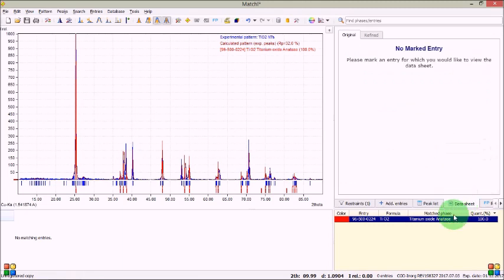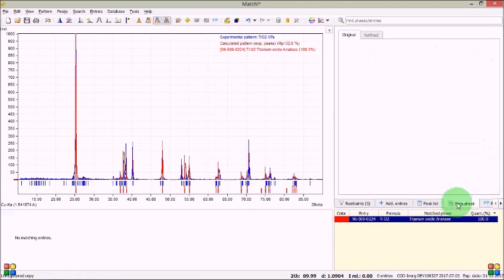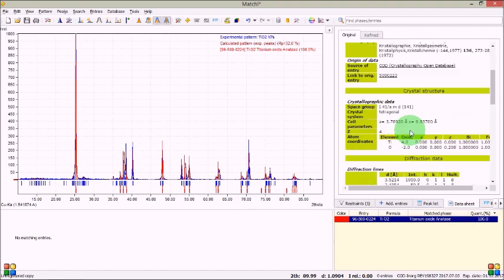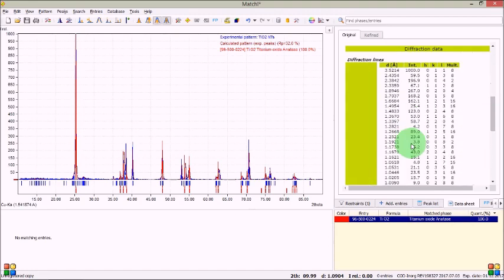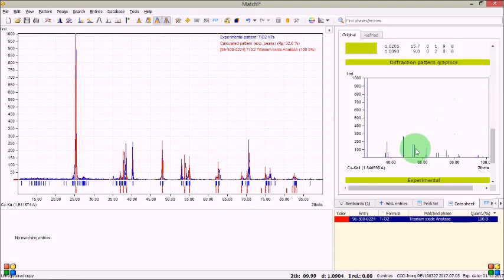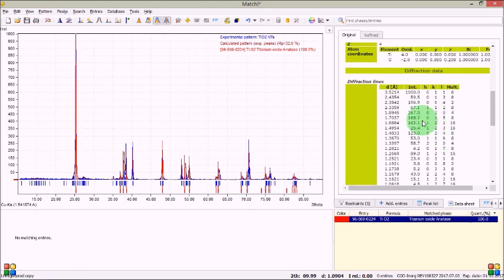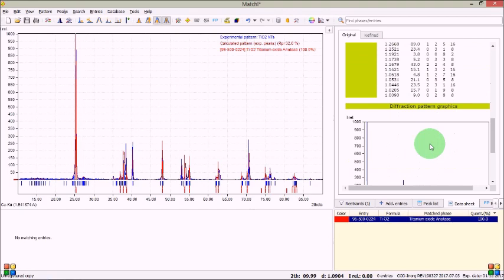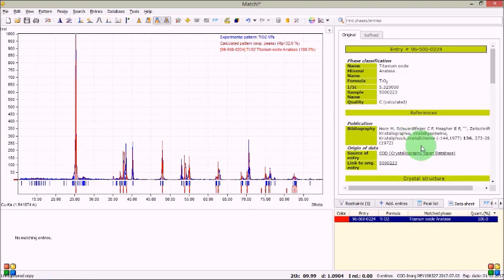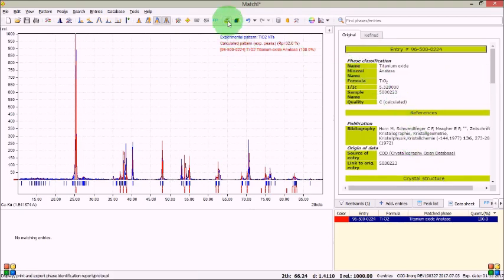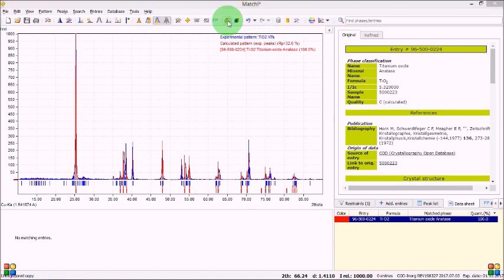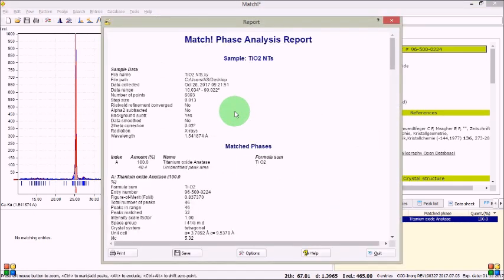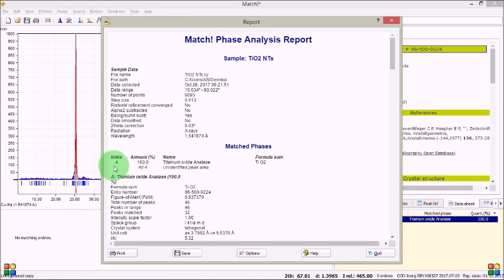Now let's see what has happened. This is data sheet you have to select it and data sheet and you can see these things these are the hkl values d spacing as well intensity. And let's see the printable data sheet. Yes this is the report.